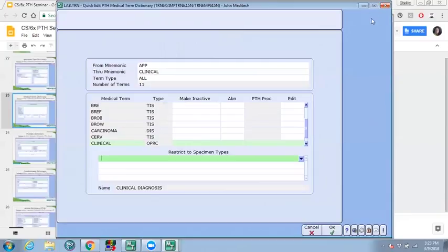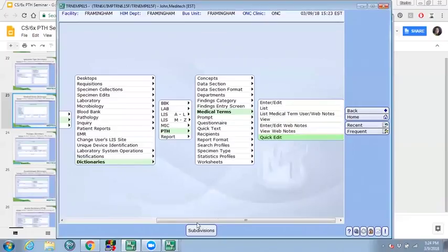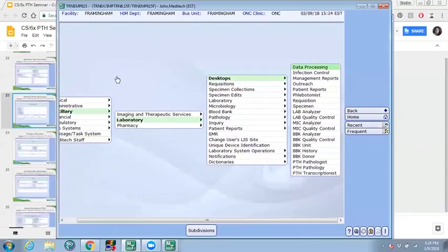This concludes the dictionaries for a pathology case. Obviously, we do have the other dictionaries that Alicia will go over, but before I conclude my portion of the training, I will branch over really quickly to see how all these dictionaries are tied together, from the beginning when an order for a pathology case is placed until it's resolved.